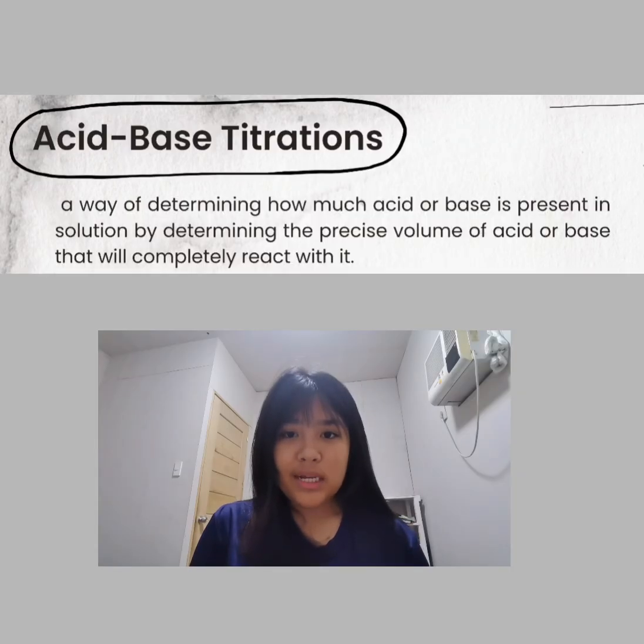Acid-base titration, a way of determining how much acid or base is present in solution by determining the precise volume of acid or base that will completely react with it.